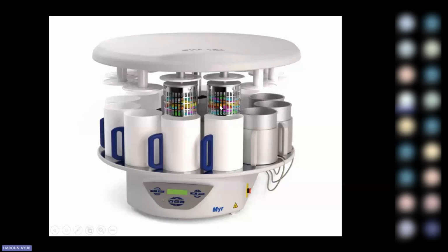Then we also have 3 wax baths if we have 2 carousels inserted in the machine, or 2 wax baths if we're only operating with 1. So this particular feature offers automated tissue processing. If you leave it overnight, by the morning you'll be able to get your tissues done and settling in wax. You have an automated process. You have a delay process that you can set up so that if you want the tissues by 8 a.m. in the morning, it will delay the start until then.